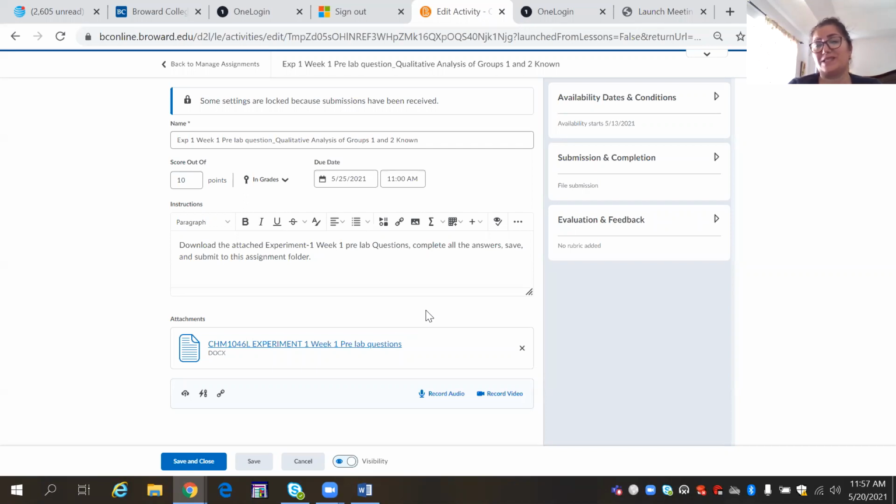So for the first 4 weeks, it is basically presence or absence of ions. In order to say the ion is present, you have to look and wait and see evidence that is expected from that ion to show. If you don't see that evidence, you would say that ion is missing.